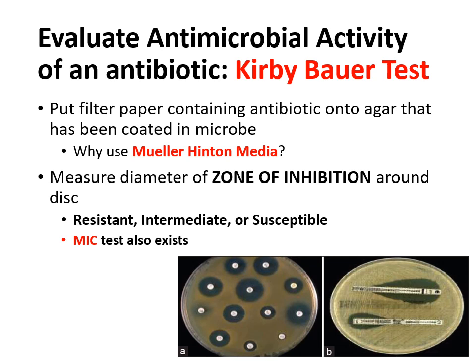Now, when we talk about antimicrobials and antibiotics in the laboratory setting, or even in the medical industry, you're going to want to know, well, how good is that antibiotic? And how good is it at killing each particular bacteria or pathogen? Because as you know, one antibiotic isn't just going to kill every single possible bacteria.